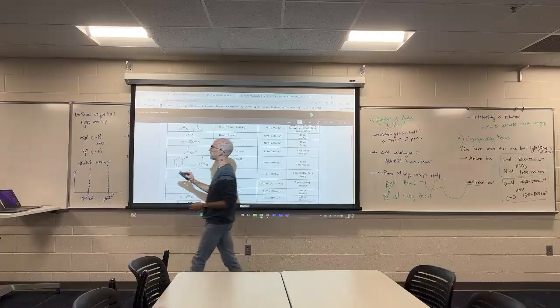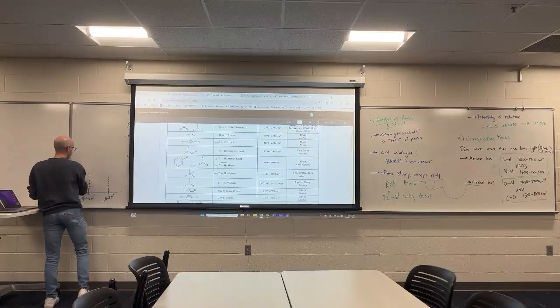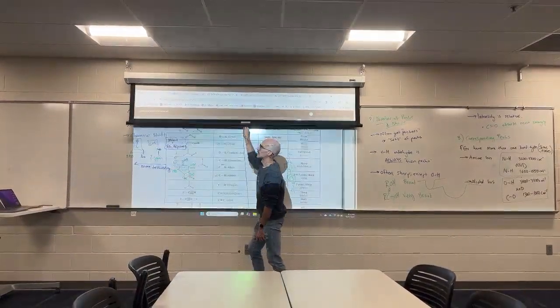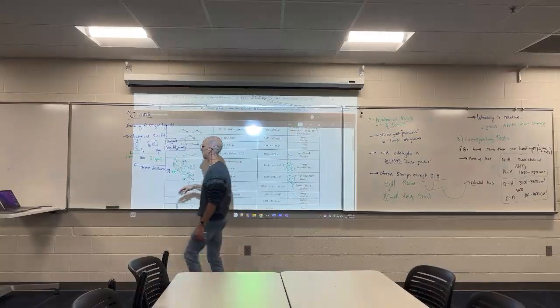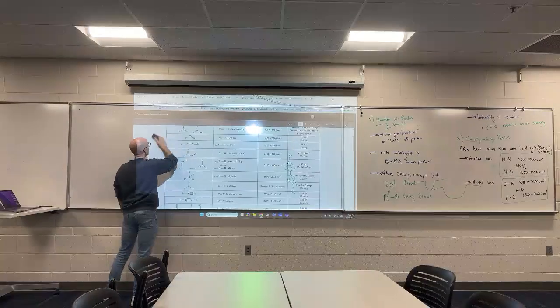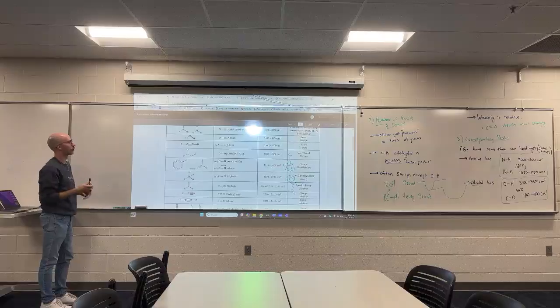Here's what I would like you guys to do. Using your correlation tables, I would like you to find the corresponding peaks between these next few groups.